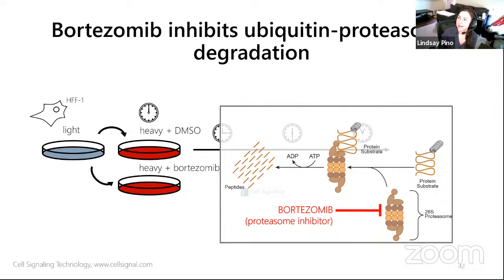So while I'm looking at the chat, I do not personally have a good resource for examples of protein turnover timescales, but if someone knows one off the top of their head, please let us know. How does pulse SILAC DIA compare to pulse SILAC TMT in terms of accuracy and precision?